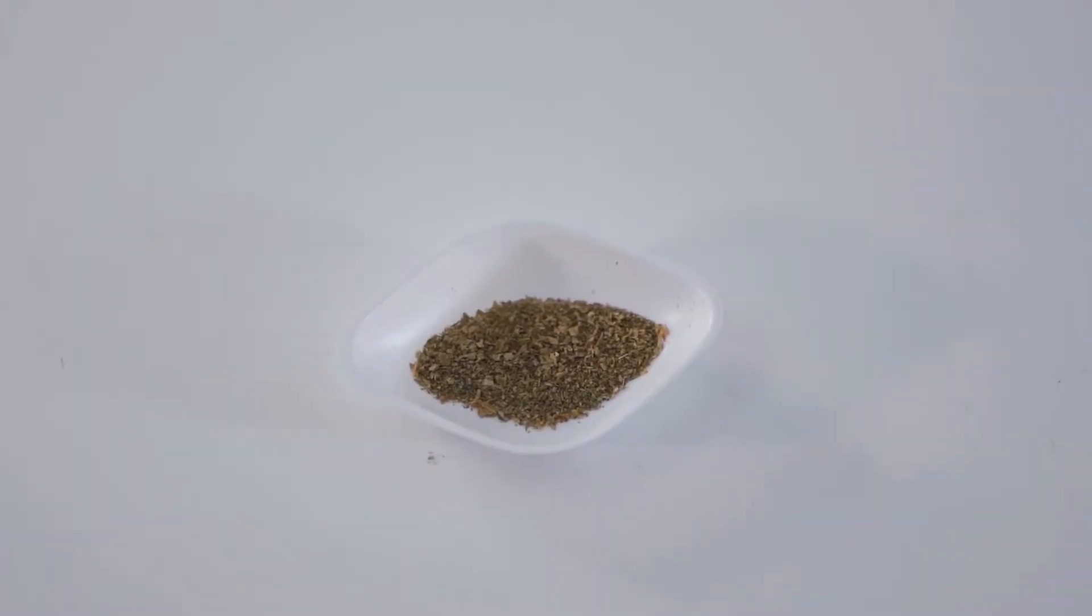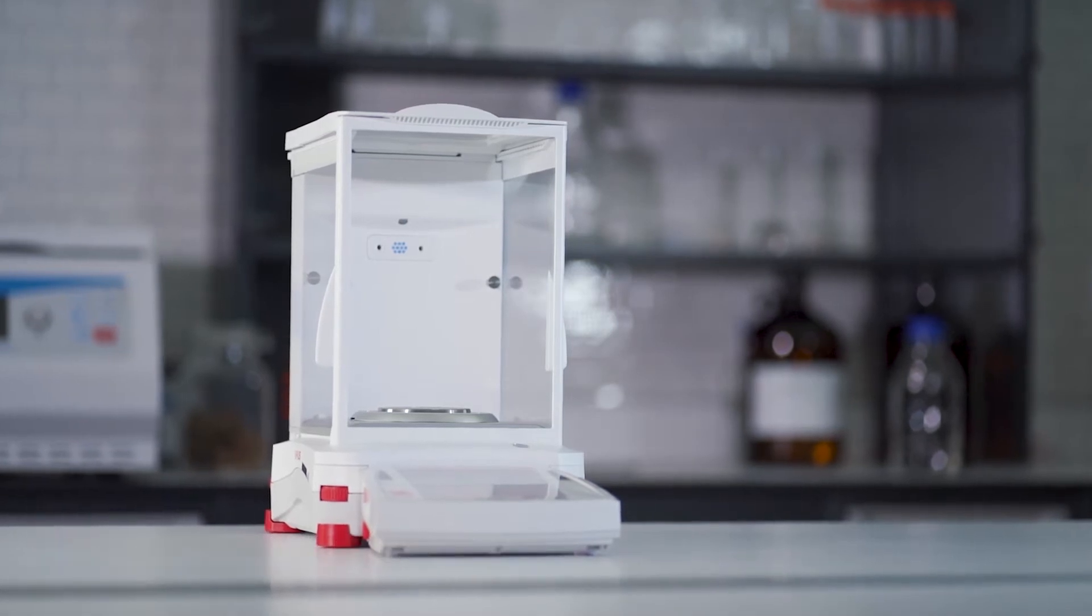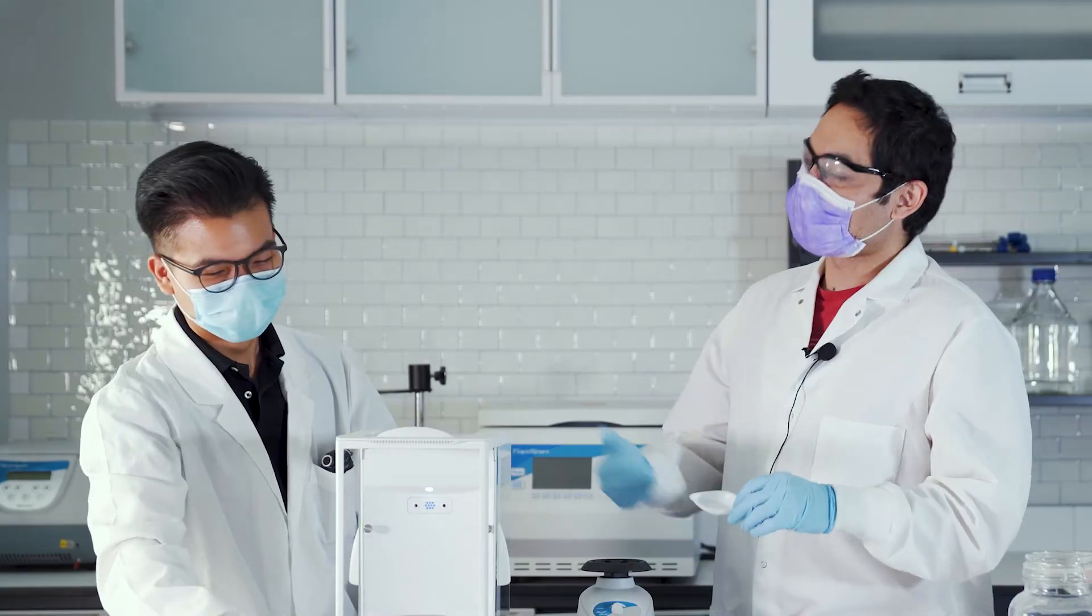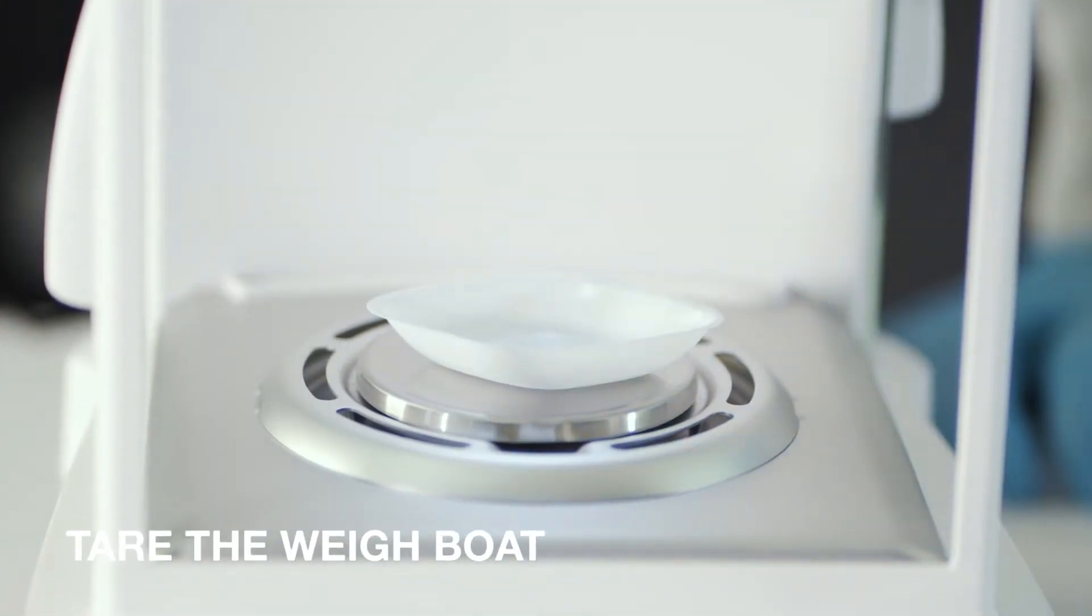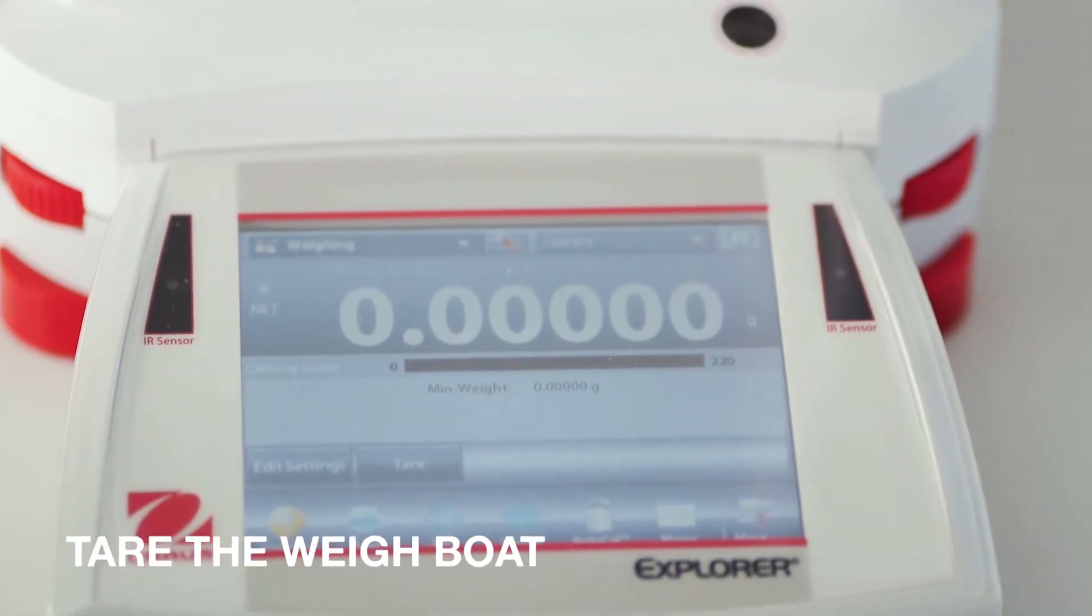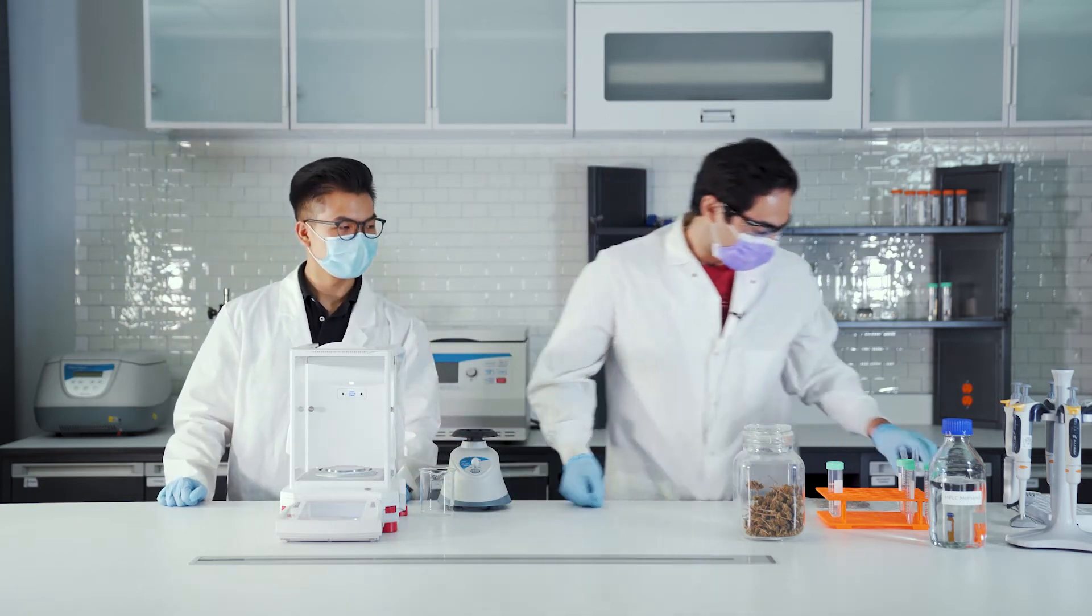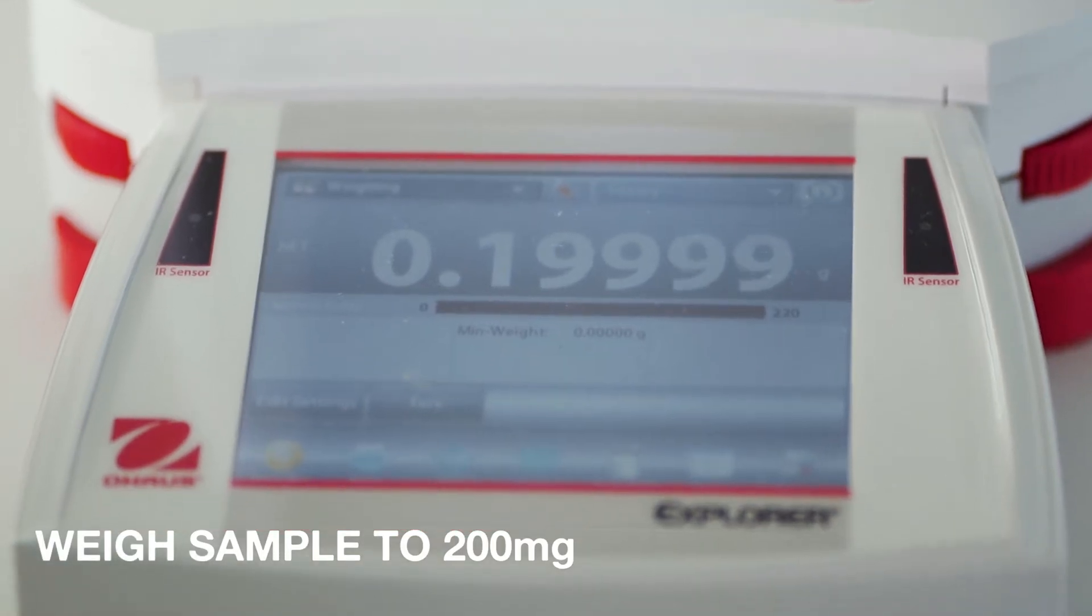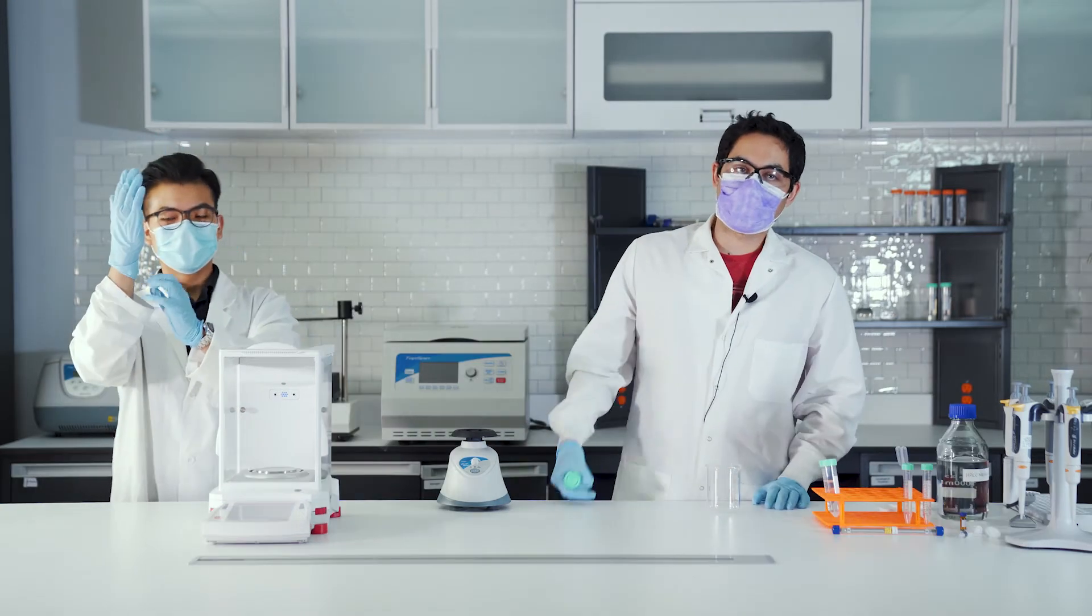Now that you have a nice homogenized sample, the next thing to do is we want to weigh out about 200 milligrams. The first thing you'd want to do is you'd want to tare the weighboat. After taring that, let's add about 200 milligrams. All right, so that's about 200 milligrams. Close enough.